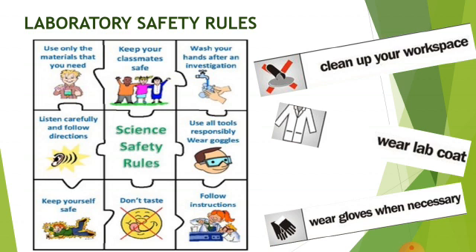Wash your hands after an investigation. It's very necessary. Your hands should be clean after the investigation, after any procedure. Use all tools responsibly and wear goggles for the safety of your eyes. Follow the instructions, very necessary. Don't go here and there and don't implement your own steps. Instead, you should follow the instructions given by your teacher.